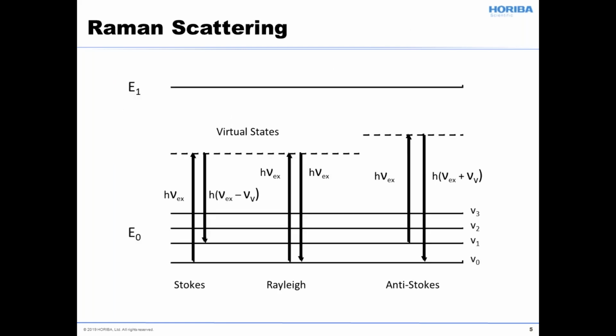of sampling. All right, so here is what I call the obligatory energy diagram describing Raman scattering. In the center, you see the energy diagram for Rayleigh scattering. What you have is, let us say, the molecule originating in the ground electronic and ground vibrational state.